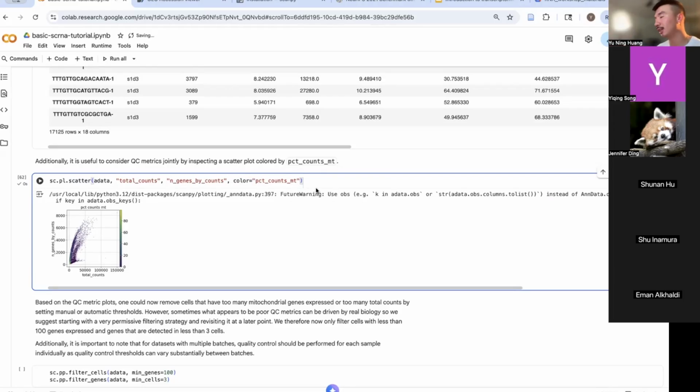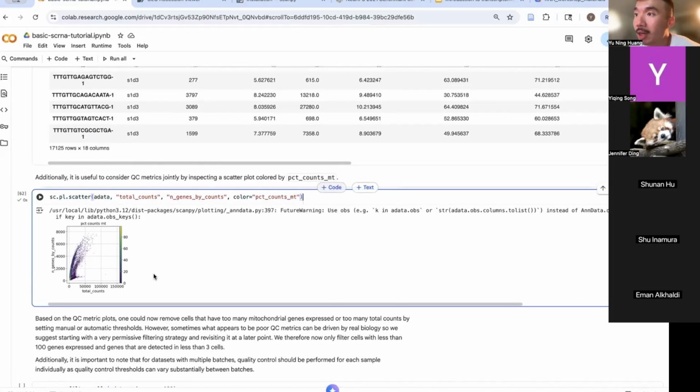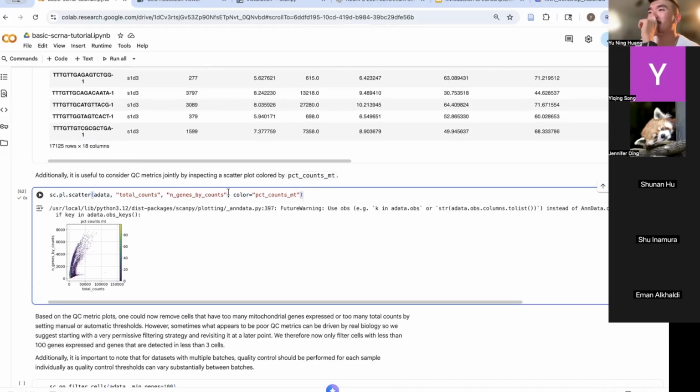In single cell RNA-seq, we can decide how many cells to flow through the droplet, how many reads per cell we will sequence, and then get a total read count. So this is just a quick quality control to visualize your cells' sequencing depth. So maybe there are some cells that have, yeah. Any questions?